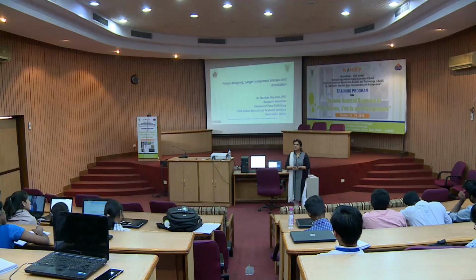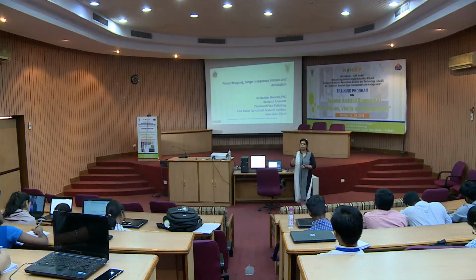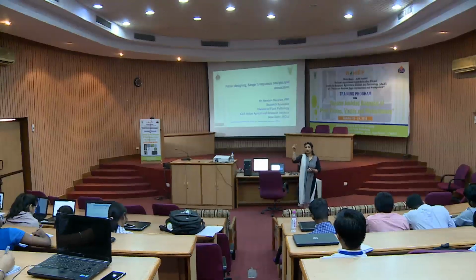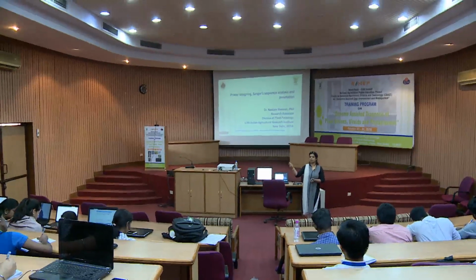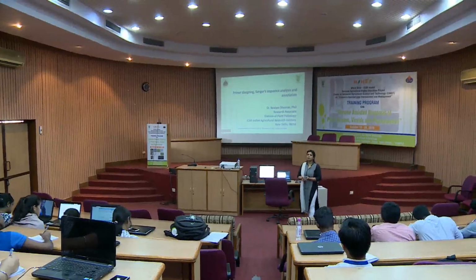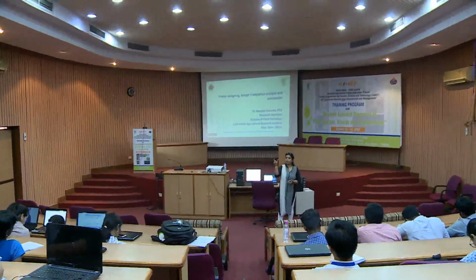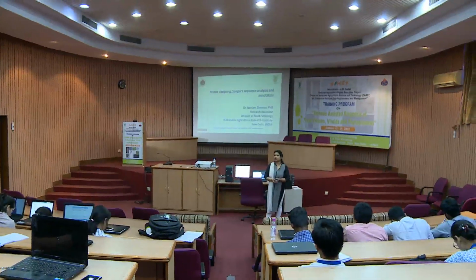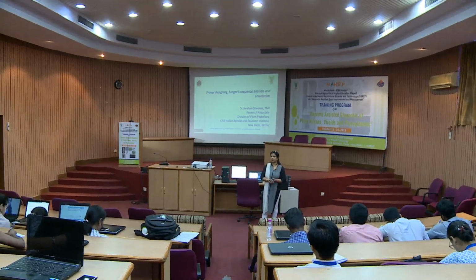Then the second criterion is the Tm of that particular primer. It should be somewhere between 50 to 62 or 65 degrees Celsius, right. Then the third criterion is the GC content of the region which you are picking to design the primer, that should be somewhere between 40% to 60%, right.